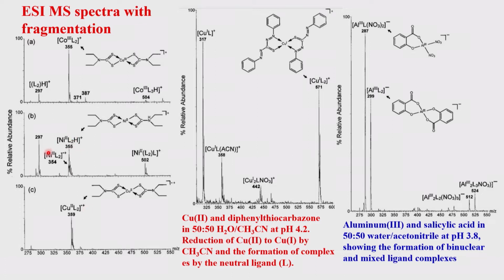Then if you look at the cobalt, the next stability is this one, then the nickel. So, therefore, the copper complex is greater, the complex is with the same kind of ligand, diethyl dithiocarbamate and all these things. The ratio is also the same, 1:2 complex, but the species found are different. The extent of species found are different, not the species found. So, the species that are formed in the gaseous phase do depend upon the stability and other parameters of that particular compound.